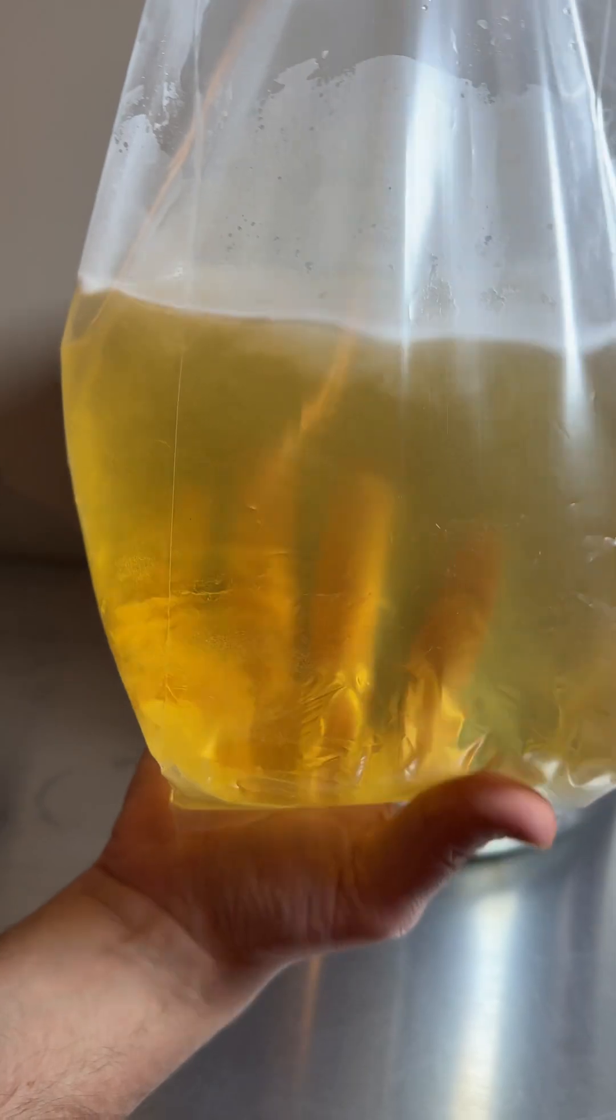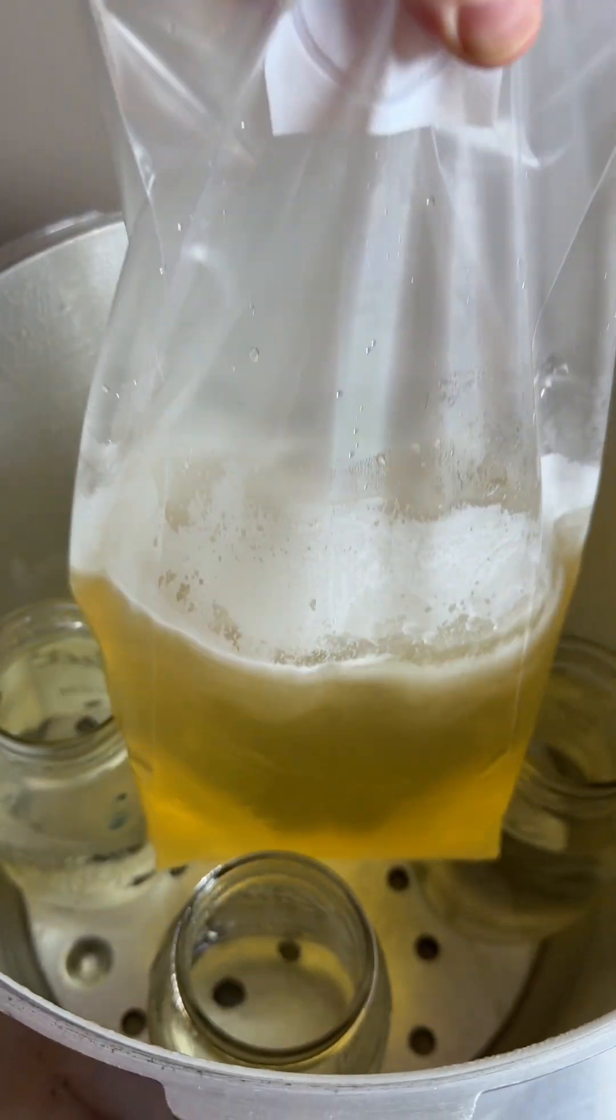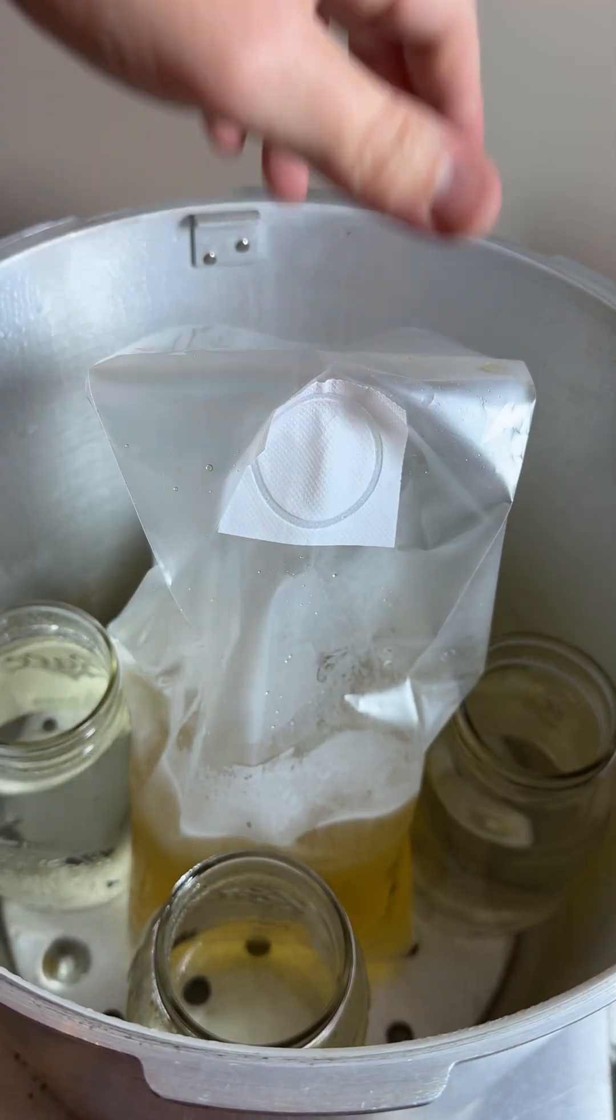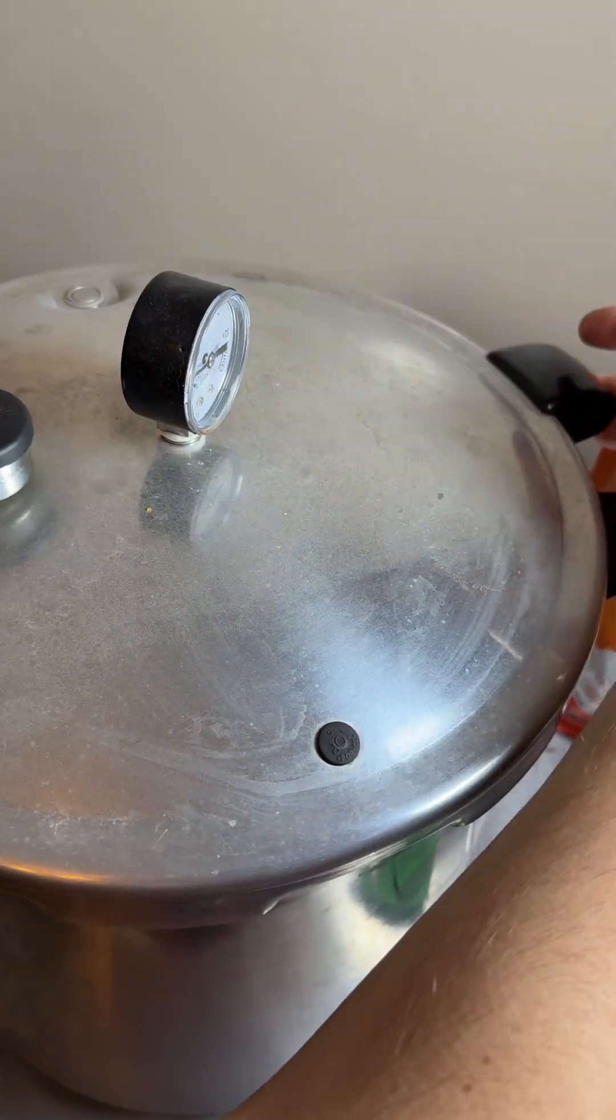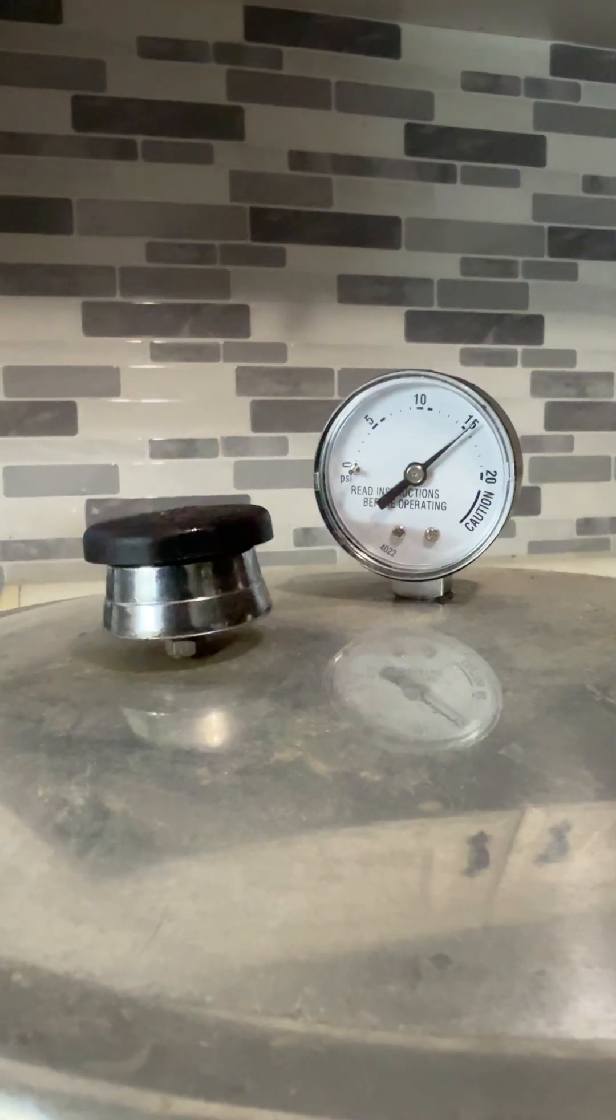Next, after the powders are dissolved in the warm water, I put the bag inside of a pressure cooker with 4 jars of water on every side to keep it supported, and then some clips on the fold of the bag to keep it shut.